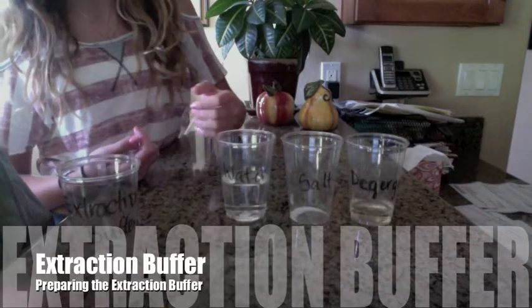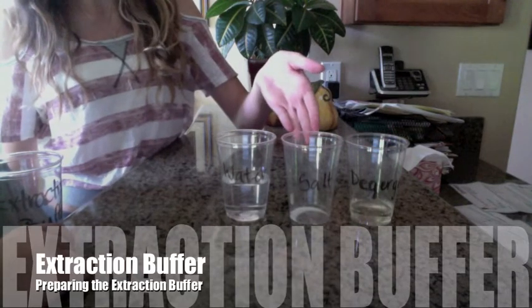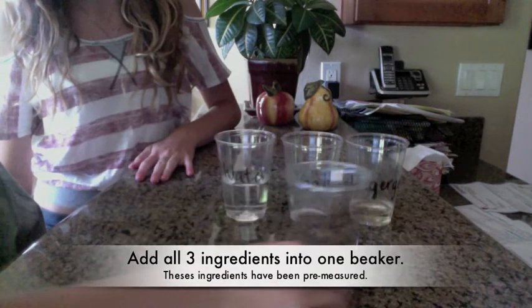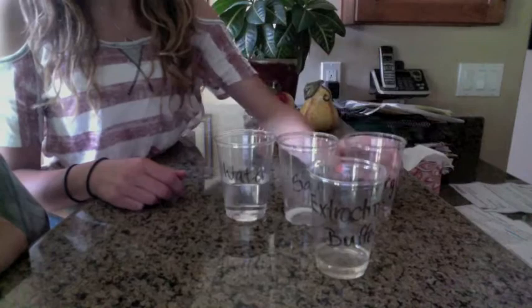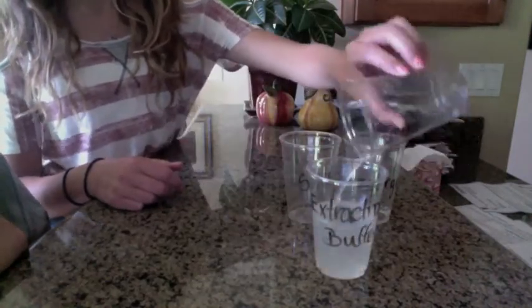First, you must prepare the extraction buffer. You do this by using 3 simple household items: detergent, salt, and water. You are going to add all of these 3 ingredients into one beaker. You need 2 tablespoons of detergent, 1/2 teaspoon of salt, and 1/2 cup of water.